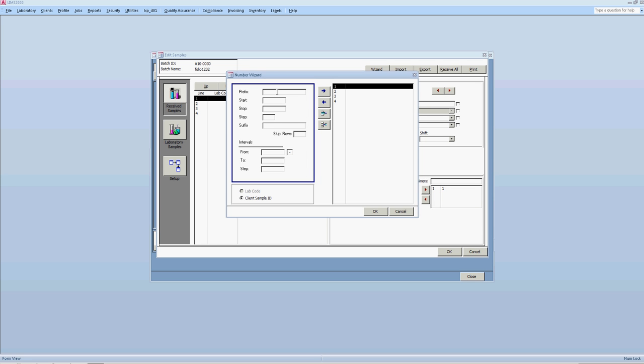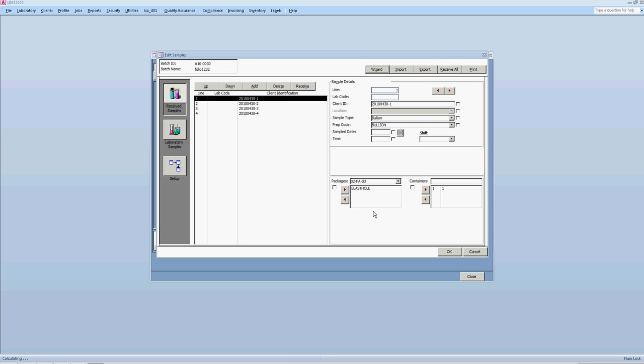Okay. So one to, so that would be what the prefix example would be? It will be 2010-04-30-dash. And then start in one and end in four. And four. Stop in four. And then hit the arrow. And then click OK. Okay. Okay.